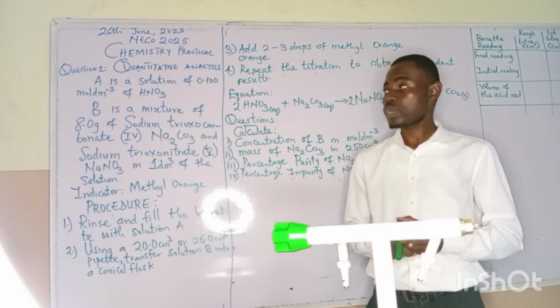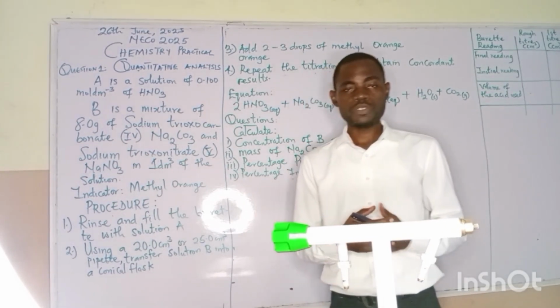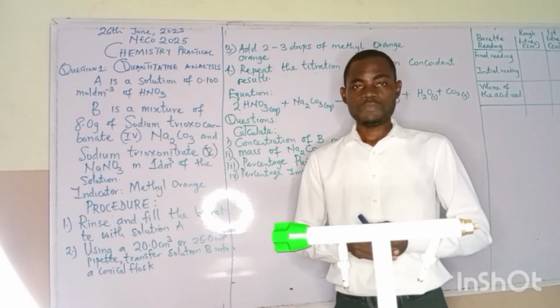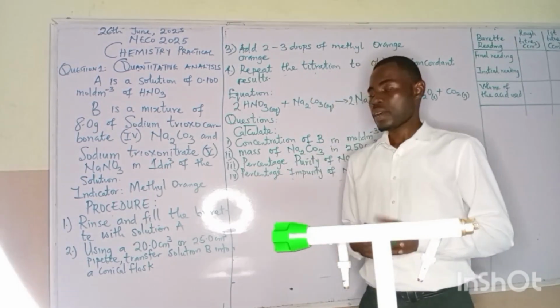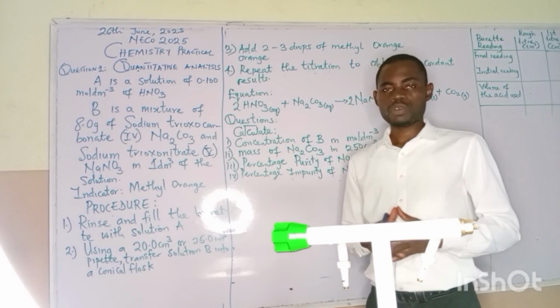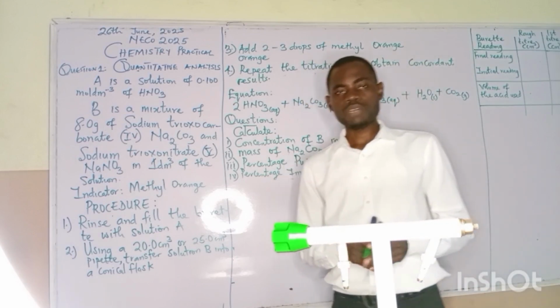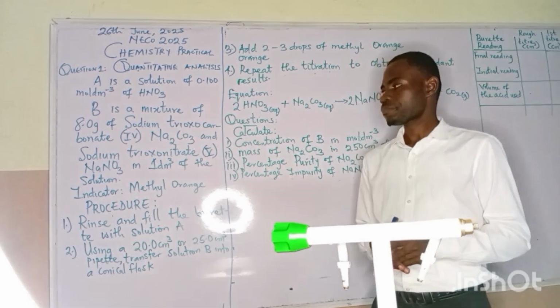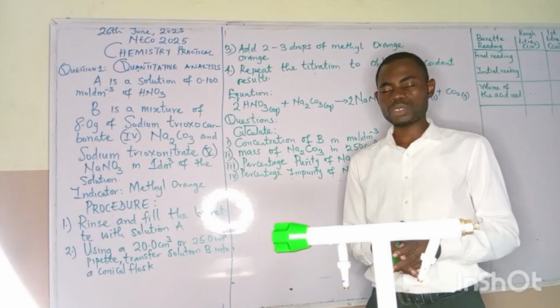As we all know, we are in the season of NECO 2025, and we have released a lot of videos on chemistry practical, physics practical, biology practicals, and some other practicals, and we continue with our chemistry practical. A lot of videos have been released. This is another video that we are bringing to your screen, especially question 1, quantitative analysis, titration.